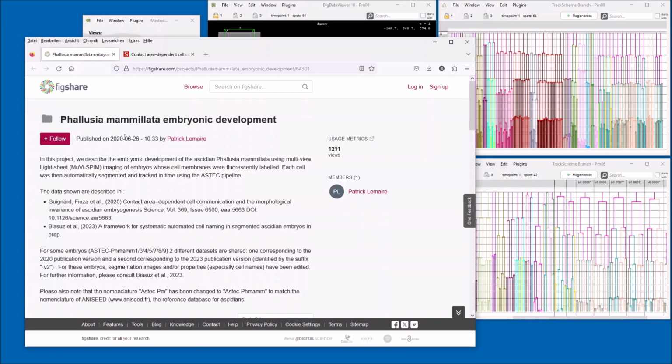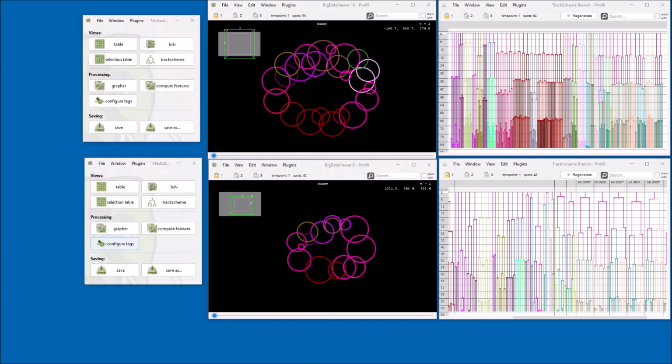The dataset has been published by Patrick Lemaire, and it contains 10 embryos of Phallusia mammillata embryonic development. All of these 10 videos show the embryos between at least the 64 cell stadium and the 200 cell stadium.